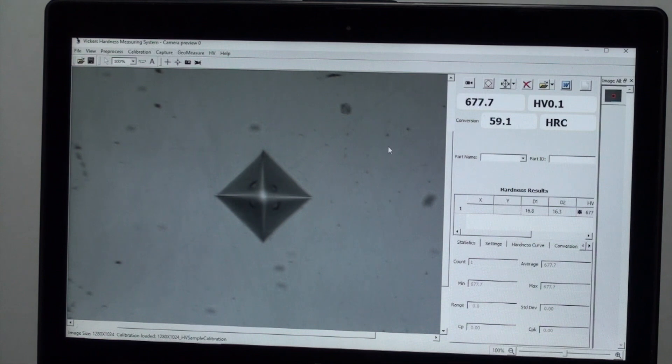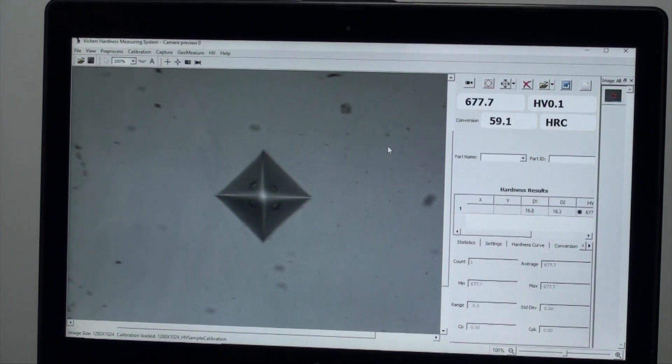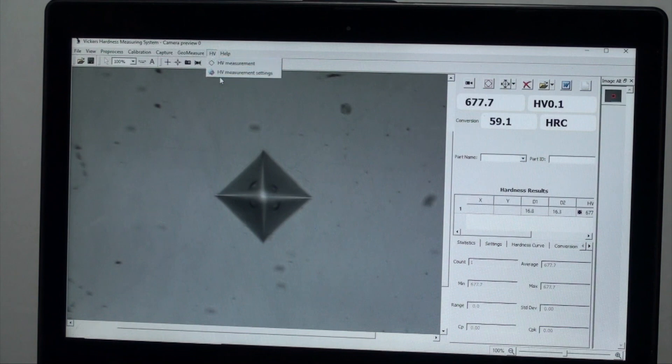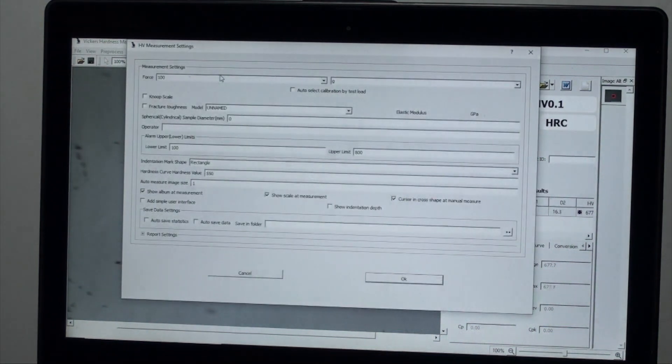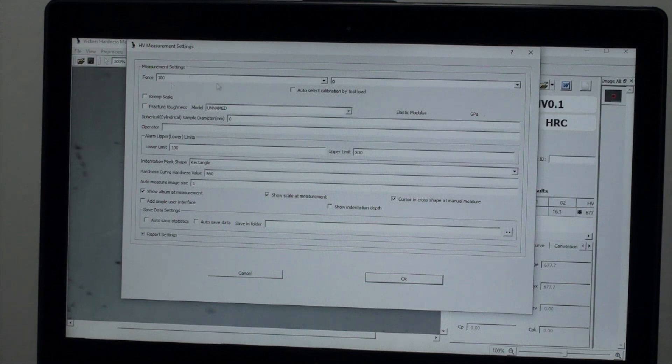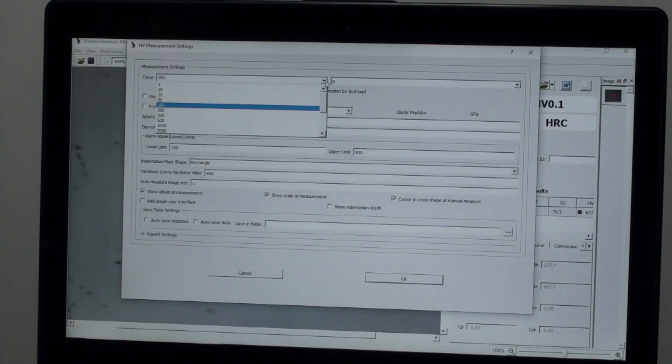First power up the machine and then power up the software. Under HV you will find HV measurement settings. The force should match your weight selector settings on the machine dial. The test blocks that come with the machine have a suggested weight load to use.